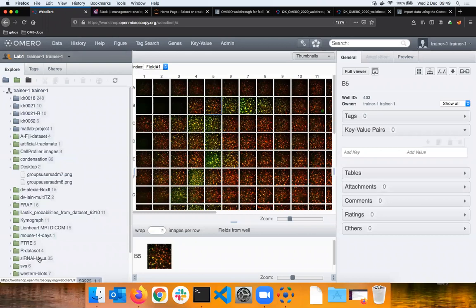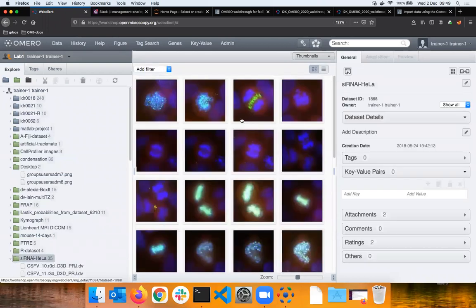I will return to the conventional images. How is it possible? Well, again, the Java library called Bio-Formats is reading those images on the fly. As I, for example, double click on it and it opens in a full viewer, then Bio-Formats is called, and the Bio-Formats library consists of readers, and it will pick an appropriate reader to read the image I just clicked on.